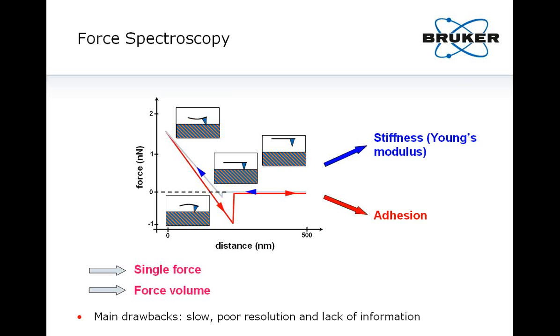So this technique can be considered as quantitative, but not directly quantitative, because the Young's modulus cannot be directly extracted. The force curves have to be exported, and the Young's modulus can be calculated from the slope of the extension curves by using different types of software.